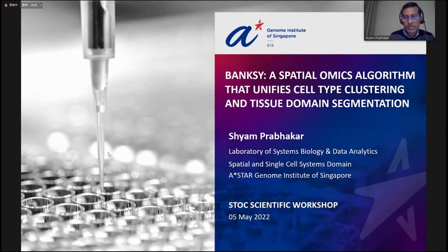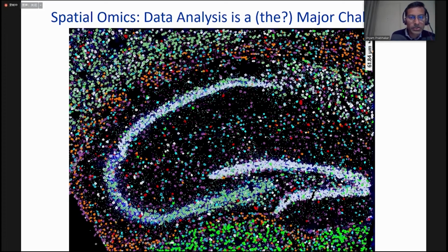All right, so I'm going to talk about the BANKSY algorithm for spatial omics, integrating or analyzing various kinds of spatial omics data to infer various properties of the tissue. And first, as you've gotten a flavor from the meeting so far, in spatial omics, technologies are moving very, very fast, but data analysis is a major challenge. The algorithms have not kept pace, and definitely benchmarking has not kept pace.